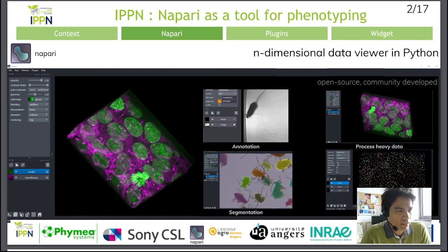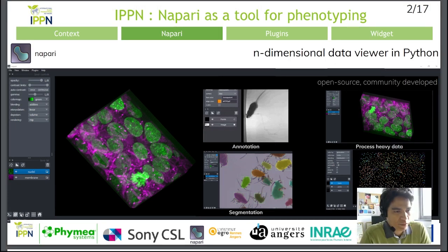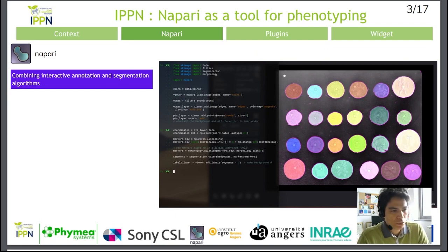Napari is an n-dimensional image viewer. It is ideal if you have RGB images, 3D images, or a sequence of images. Napari offers standard tools for image annotation, object segmentation, and object tracking. Napari is written in Python, which is a great advantage for the large Python community. Using this language, Napari enables users to develop and deploy their own plugins.